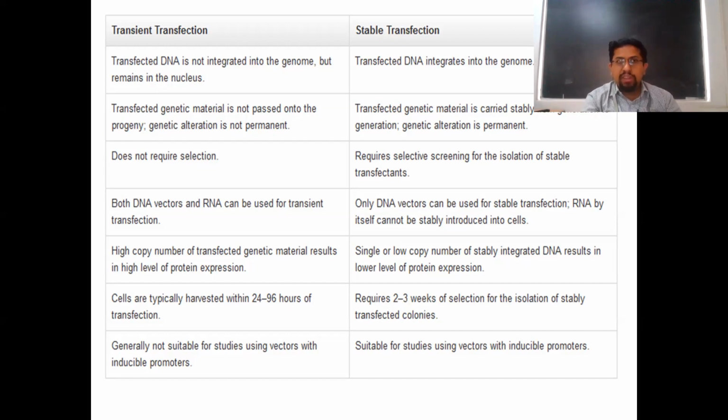You can have transgenic cell lines also wherein a given gene could be knocked out. Knocked out means what will happen? Let us say there is one particular gene necessary for infection or producing certain virulence. Your job is to remove that gene. This virulence gene will have 2 flanking regions. You will determine the sequence of these 2 flanking regions, and you will design a plasmid where you're going to have a blank cassette. Blank cassette means just a small piece of DNA which has no role, or it could have a selectable marker gene such as an antibiotic resistance gene or something like that.